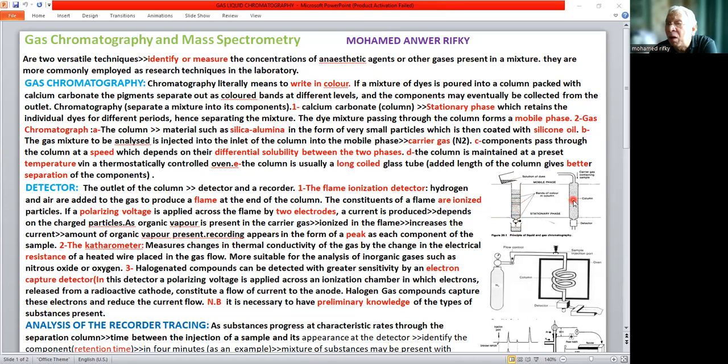This resembles what we will show later on the monitor. The supportive media are similar, and of course, instead of a cup releasing the constituents, we have what we call the detector. The pouring process is called the mobile phase, and the supportive medium where the components are fixed and then released later is called the stationary phase. So we have two phases.